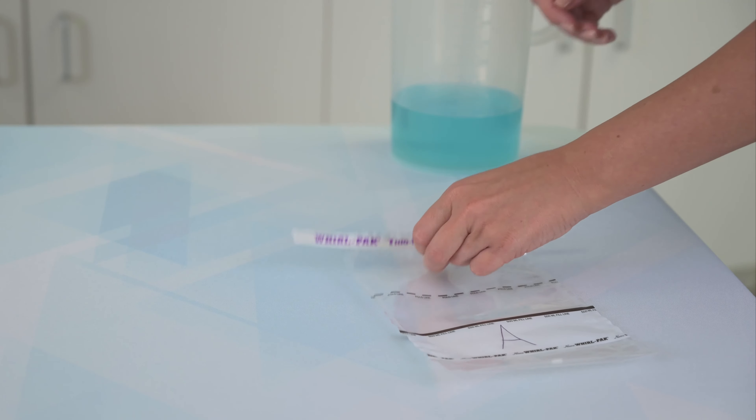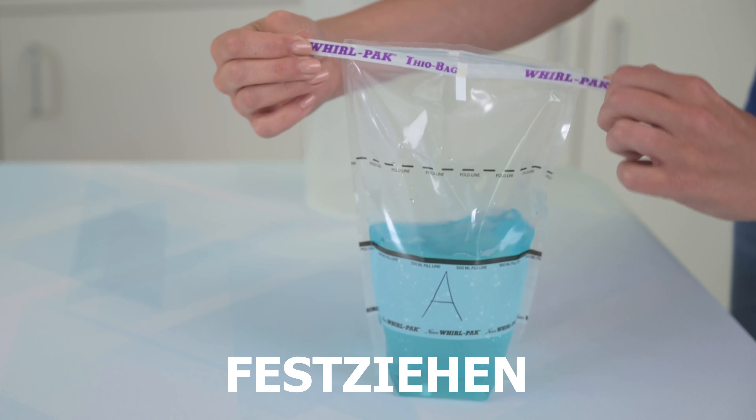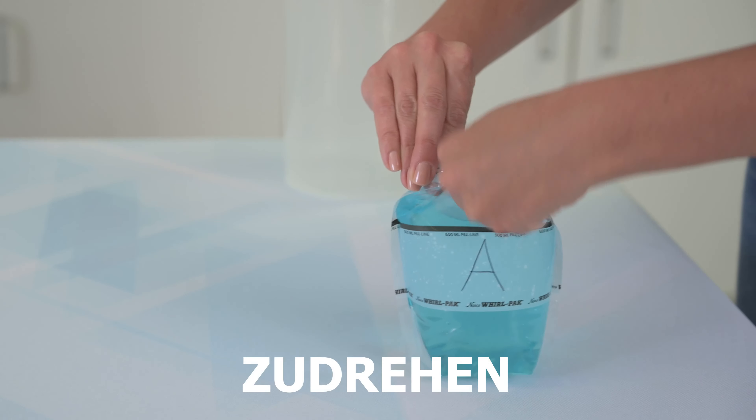With all of our closure bags, for a leak-proof closure, simply open, fill, pull tight, whirl or fold, fold in tabs, and twist.